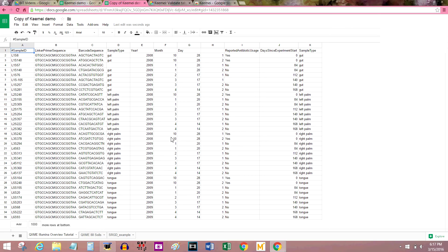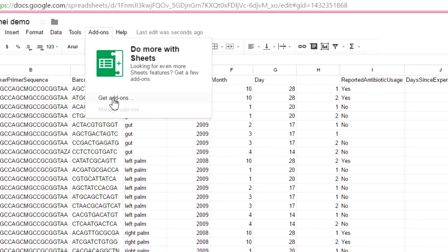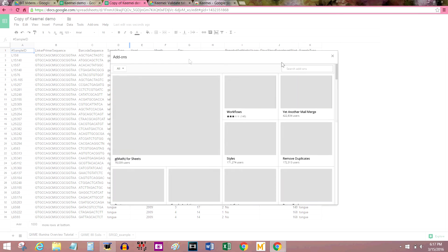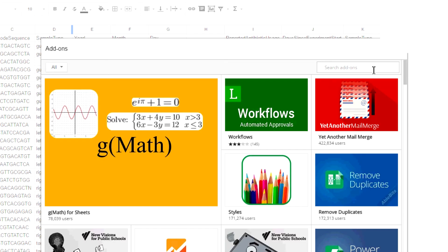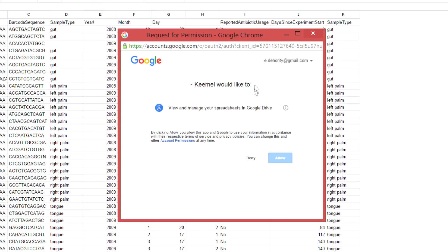This is the spreadsheet that we're going to use — it should be hosted on your own Google account and not the publicly available one. To get Keemei on your computer, go to Add-ons, Get Add-ons, and just search for it: k-e-e-m-e-i. This big blue button is how you download it. Press Allow.